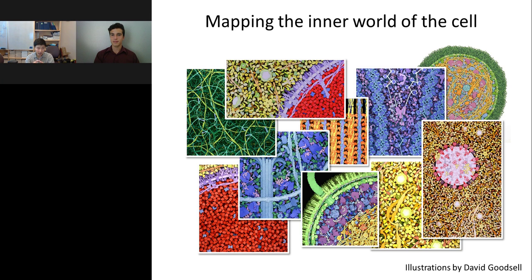And so the cell may have a certain unfolded protein response if there's too high an expression level of GFP1-10, or too high a concentration of uncomplemented GFP1-10 once it's in a cell. Now for mNeonGreen, we have not seen much difference in our limited experience compared to GFP1-10 in terms of perturbing the growth of the cell.